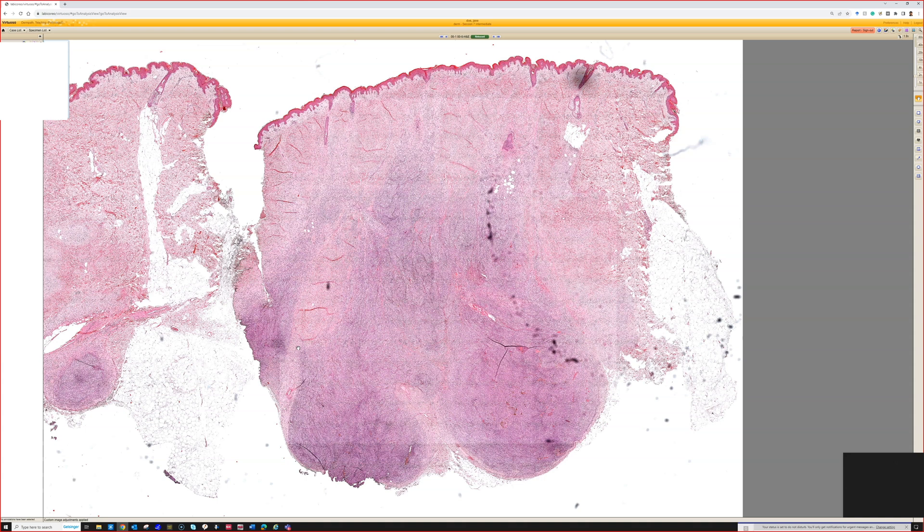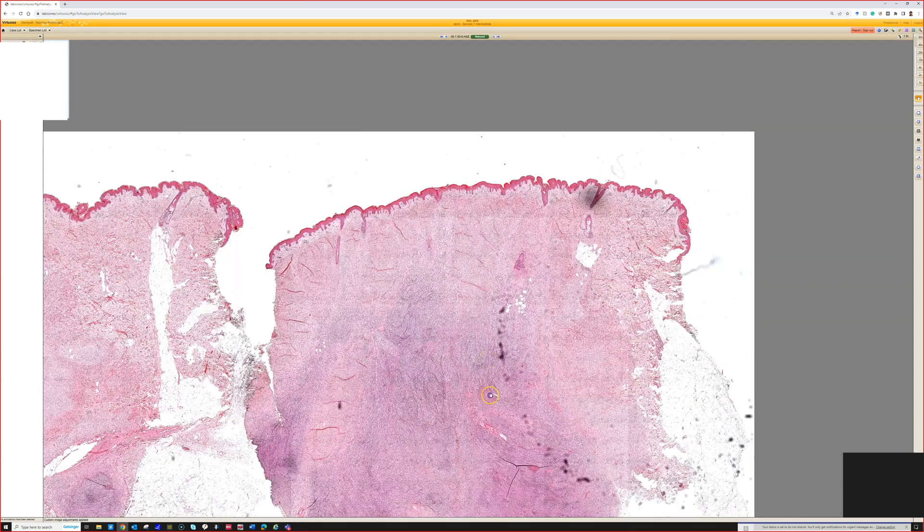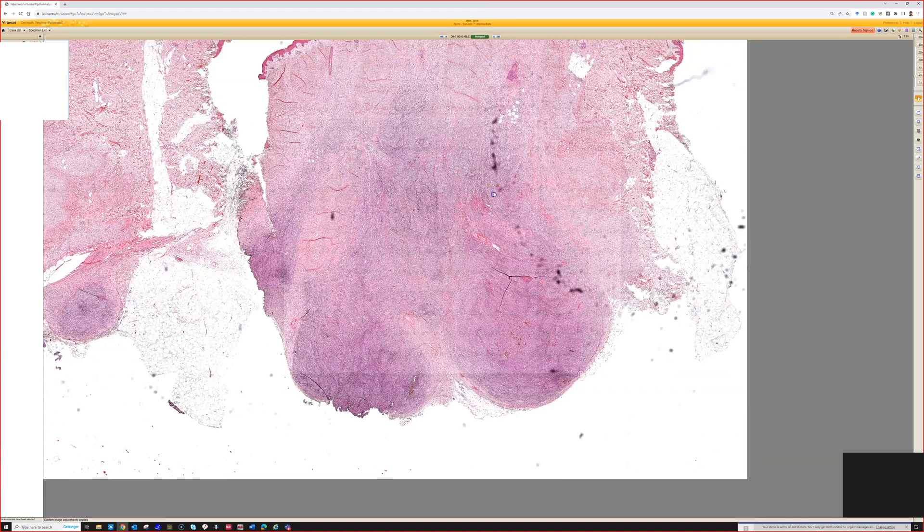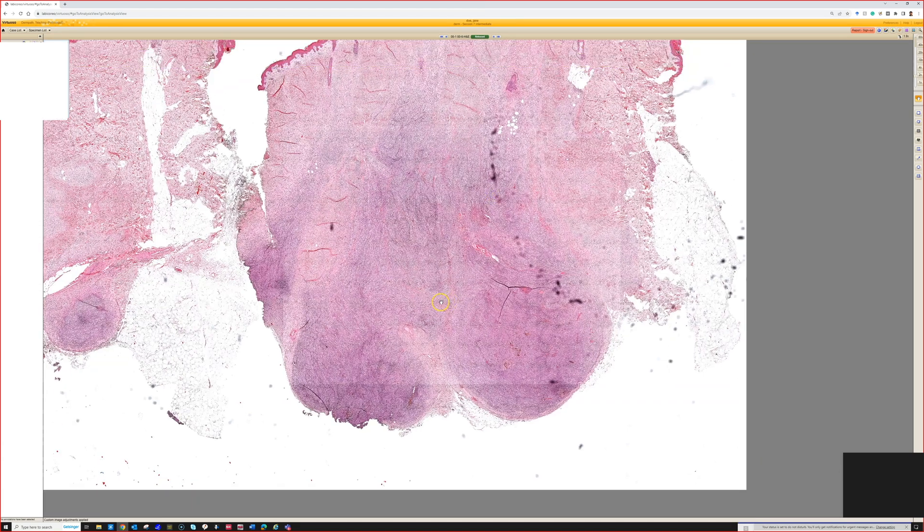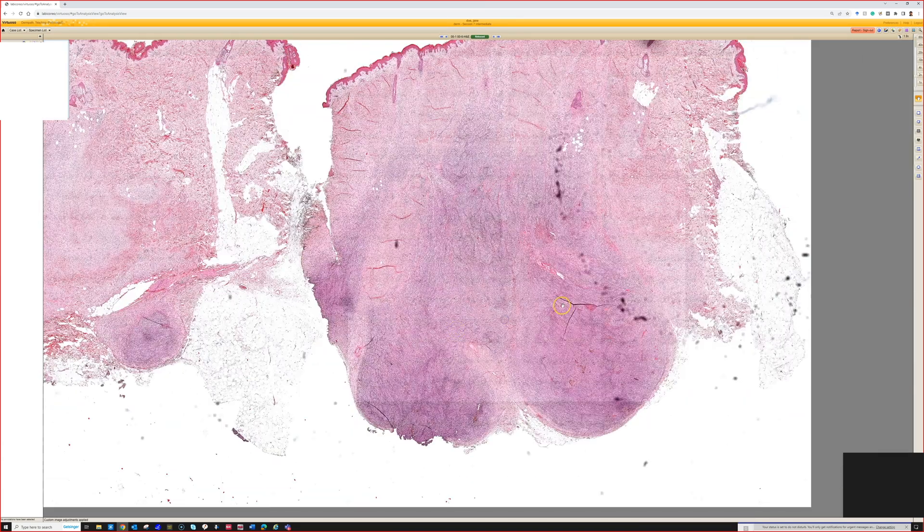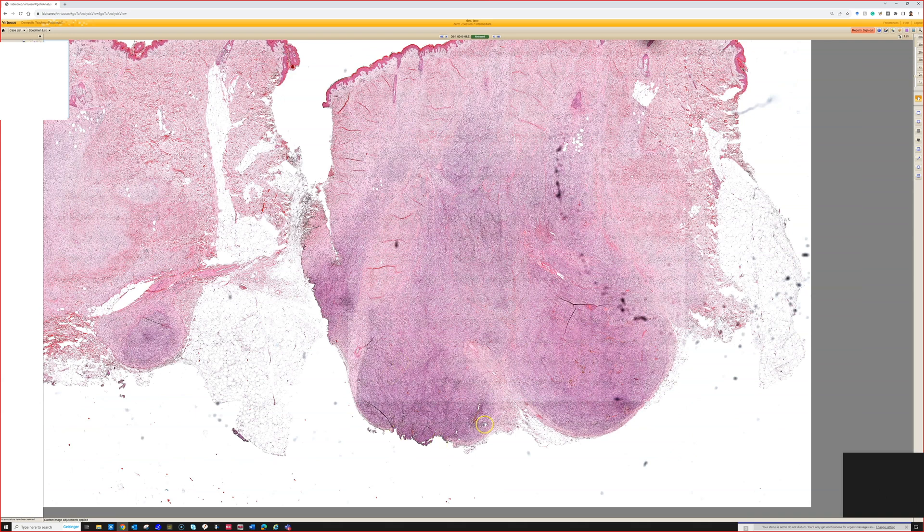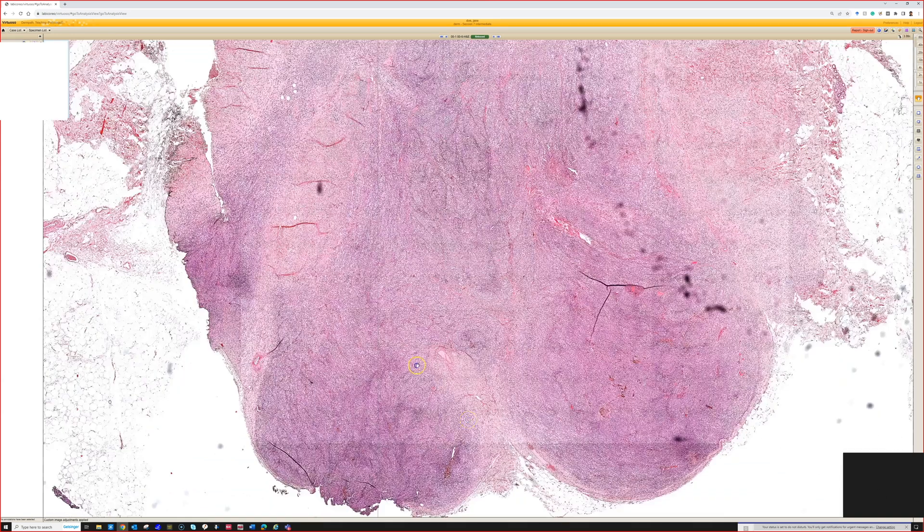It's most cellular and heavy down deep, pushing down into the deep dermis or in this case the subcutis. Up at the top it's less cellular, which is very typical of cellular blue nevus. You may have one or multiple lobules pushing down deep.